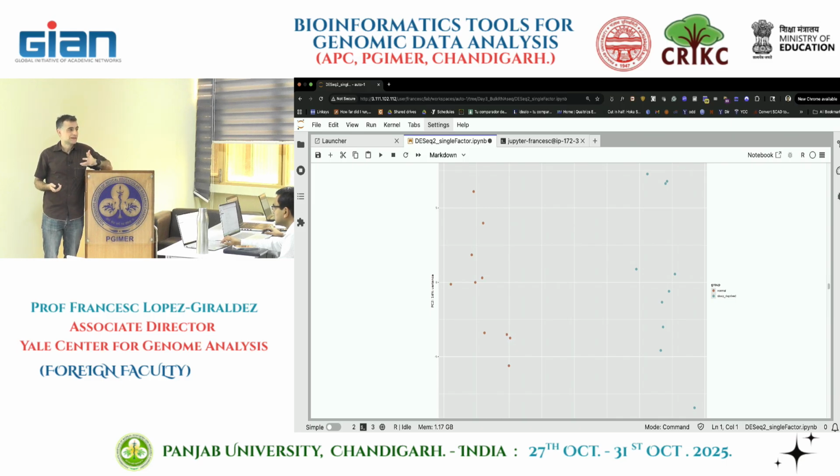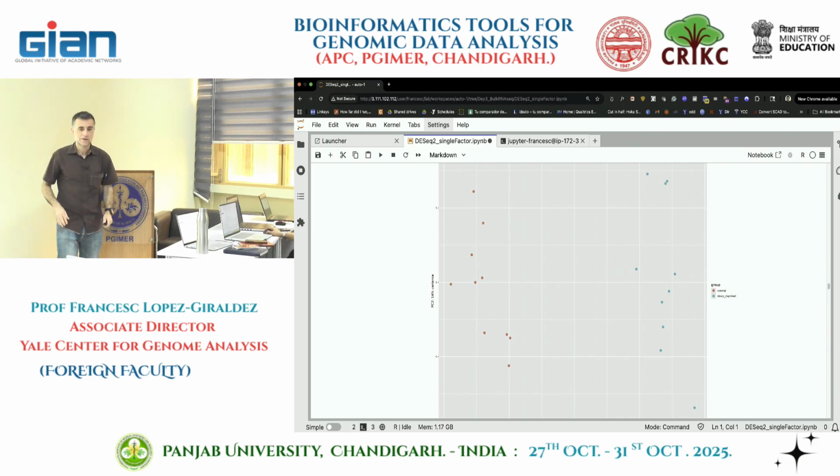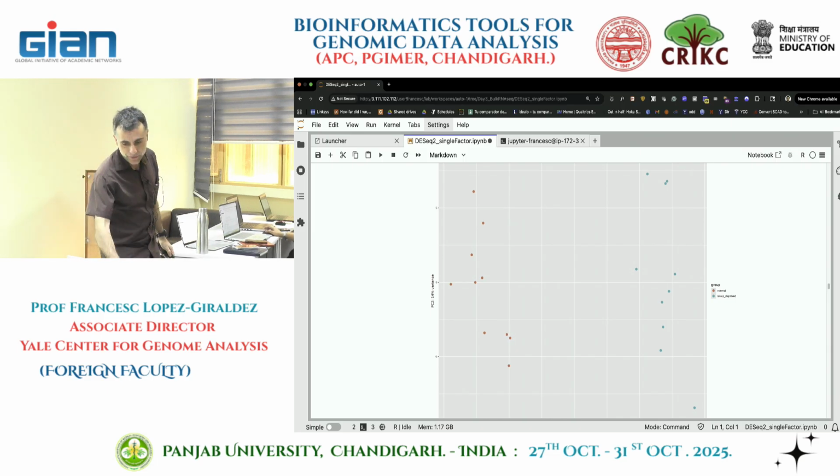It will look like a line with dots on top of a line. But at the end, PC2 is not telling us much about the story here. It's just PC1 that is splitting normal on the left and sleep deprived on the right. If you did a one-PC plot, all dots would accumulate on one side and the others on the other side. So yes, we have good grouping.